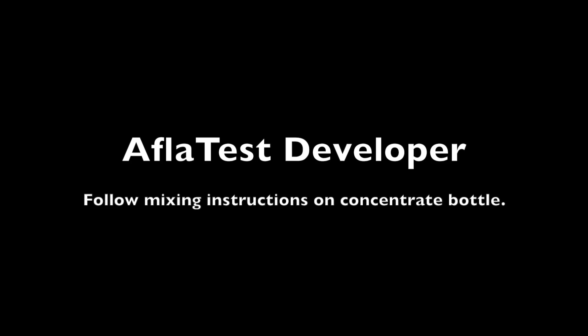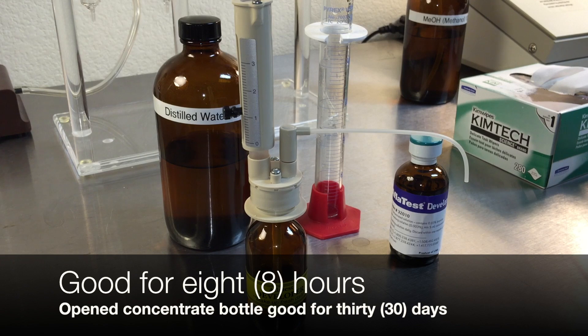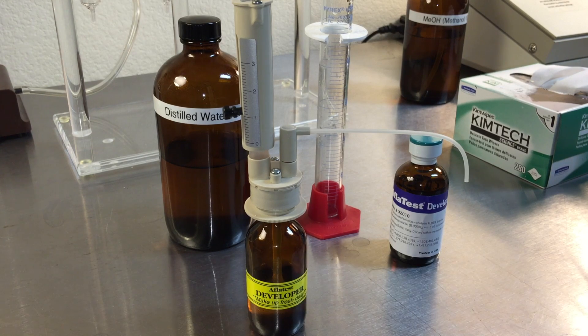Aflatest Developer comes in a concentrate good for 30 days after opening. Mix the concentrate according to the instructions on the bottle. After mixing a batch of Aflatest Developer, it is good for eight hours.